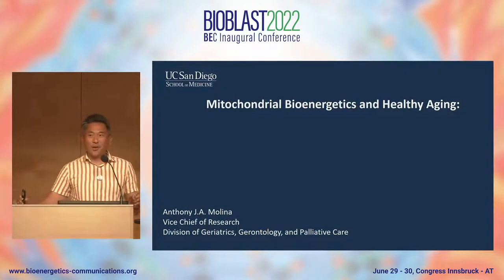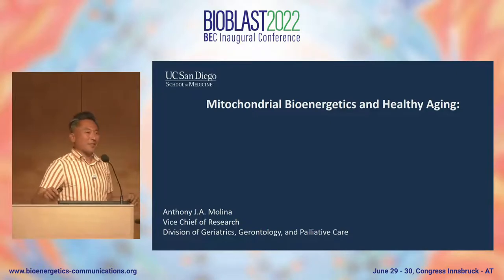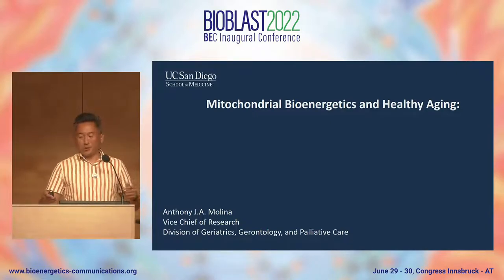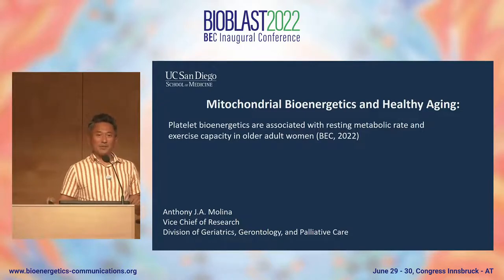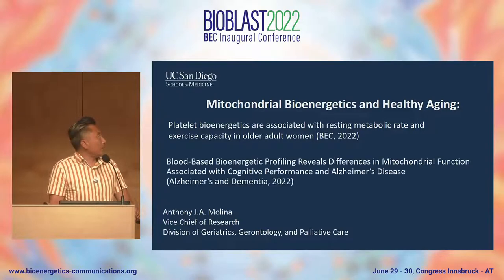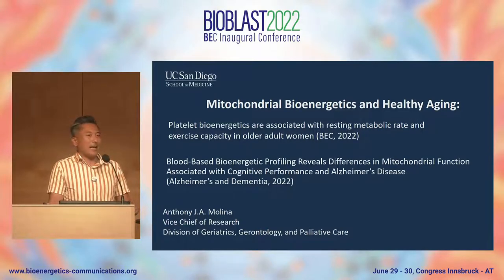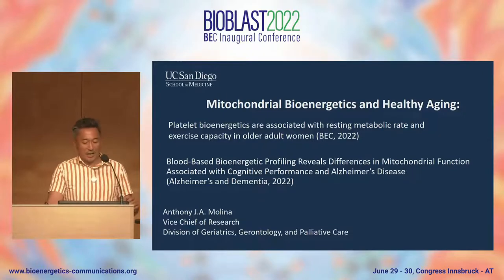All right. Good afternoon, everyone. And thank you for this opportunity to share some of the work that's going on in my lab, which is focused on healthy aging and mitochondrial bioenergetics. My goal for this afternoon is to give you a very broad overview of two recent publications. If you want to see the details, I encourage you to look at the publications themselves, one of which is now available on BEC, focused on platelet bioenergetics in older adult women. And then I'm also going to talk briefly about a paper that should be available any day now in Alzheimer's and Dementia, where we're, again, utilizing blood-based bioenergetic profiling and looking at associations with cognitive performance in Alzheimer's disease.